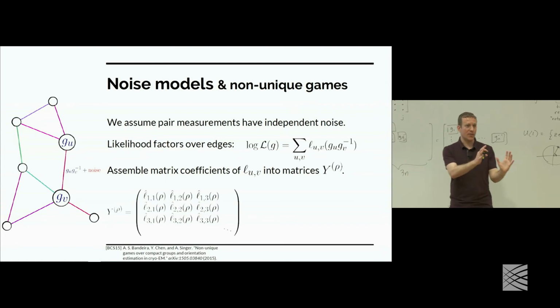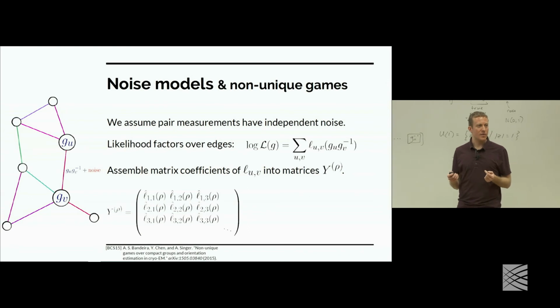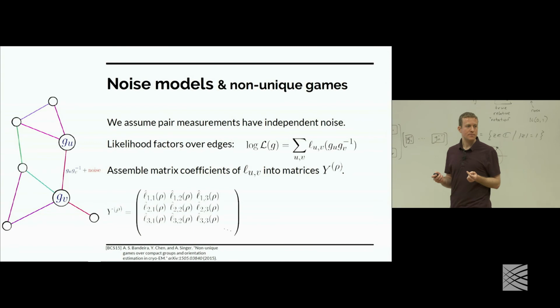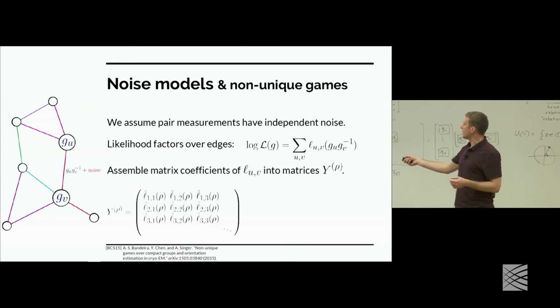So there's one for each frequency, and these are the matrices we use in the algorithm. Hopefully that answers your question about how you get different modes. I see. So you take your information and then you project it, or convert it into the basis of modes, sort of. Right. What's the lowercase l again? Oh, the lowercase l is just defined by this.